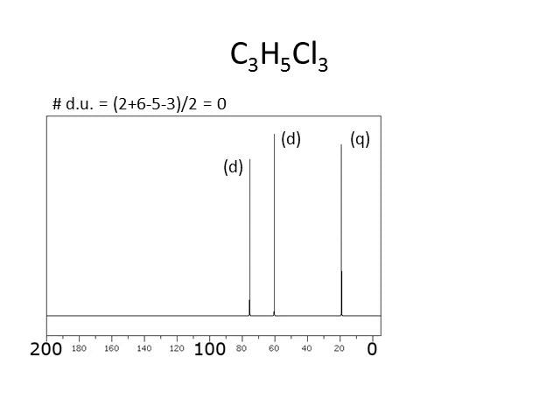I then look at the carbon-13 spectrum. And how many lines do I have in the spectrum? 3. What's that tell me? I don't have any symmetry, because each of my 3 carbons in the molecule is in a unique bonding situation. And that's why these 3 lines show up at different places along this x-axis. So I see that there's no symmetry. Oh, I should have noted I don't have an IR, and so I can't get information from the IR.